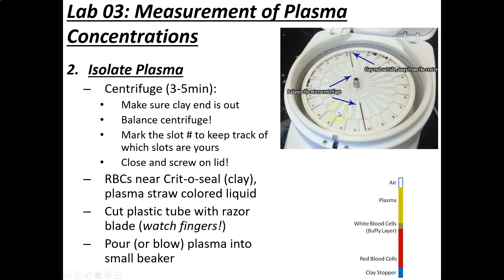This centrifuge is built specifically to separate blood in these tubes. It spins at one rate ideal for separating plasma from the formed elements — the cellular portion of blood — and you can usually do it in about three to five minutes. You close the lid, turn it on, and let it go for about five minutes. What you see afterward: clay stopper at the bottom, then red cells — that's called the hematocrit — then a white cell and platelet layer called the buffy coat, and then a yellowish clear layer at the top. That's the plasma — the liquid portion of blood, and that's the section we want.